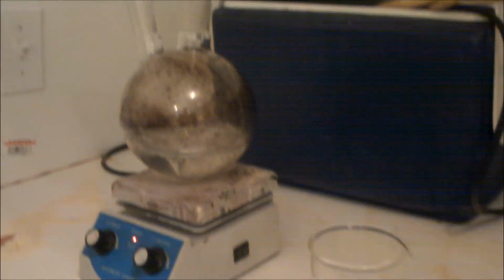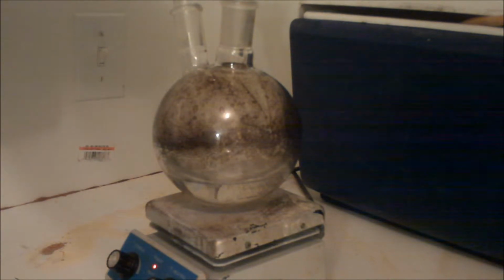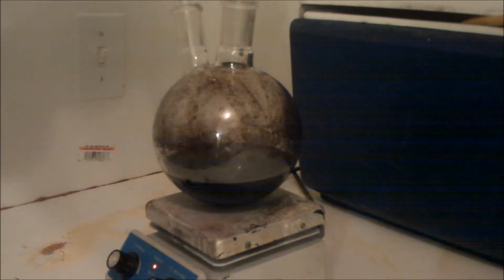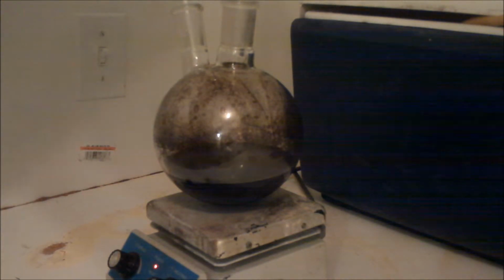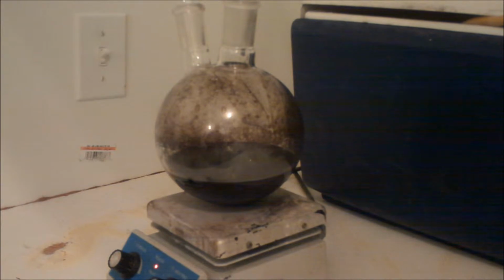So I'm going to add the permanganate to this flask, and we're going to want stirring to stay on during this. So let me add the permanganate to the flask. Make sure I get as much as we can of that. There we go. As you can see, it turned a deep purple. And up here, I will grab my pressure equalizing funnel, and I'll put the sulfuric acid here and set it up, and I'll get back when I'm all done with that.